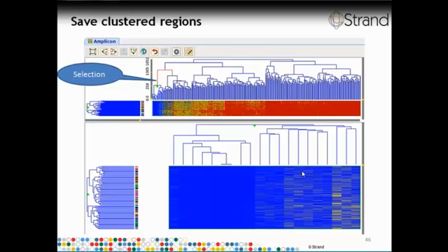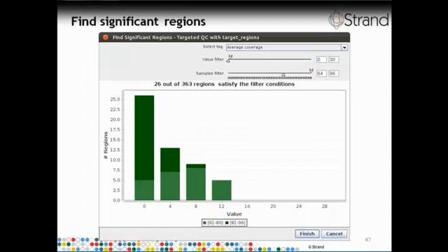But to perform all of these analyses, we need to align the reads against the entire genome, and that is possible through a small RNA alignment experiment. So if we create a small RNA alignment experiment and we click on the MiSeq button, we can choose the small RNA folder. It automatically looks through the folder, identifies the FASTA-Q files which are present inside the folder, and shows the sample loading sheet.